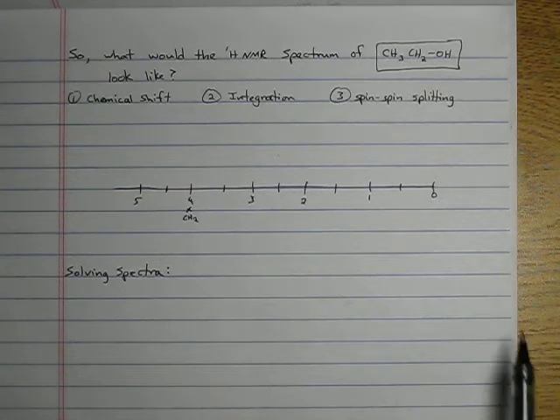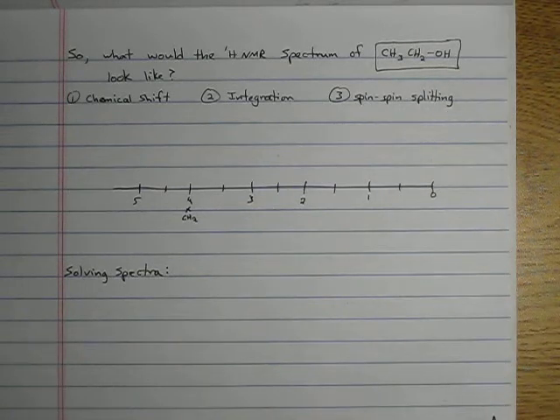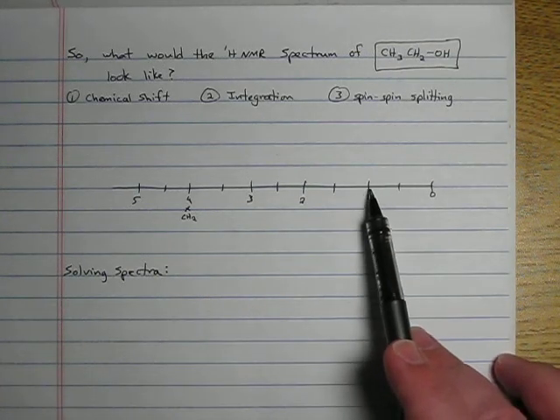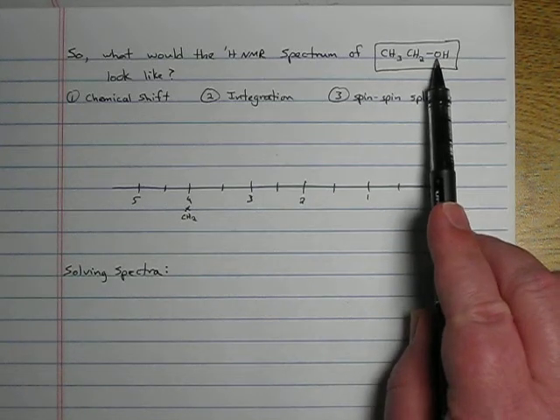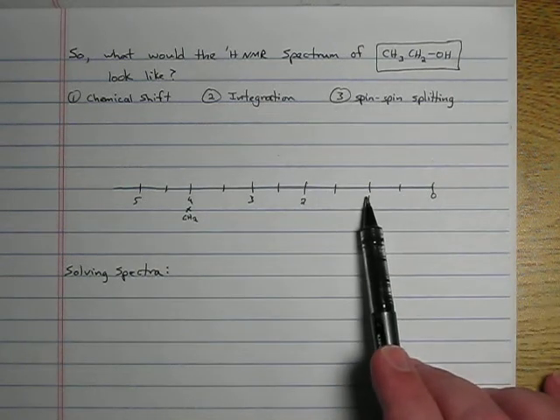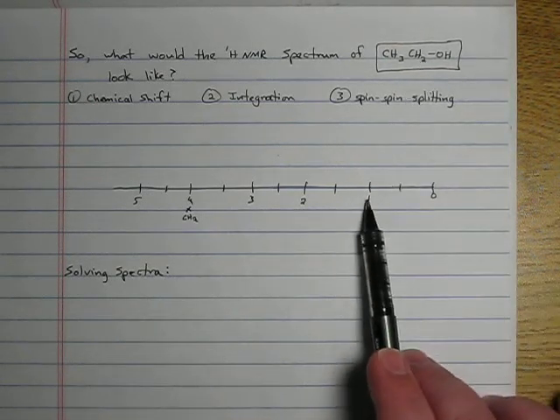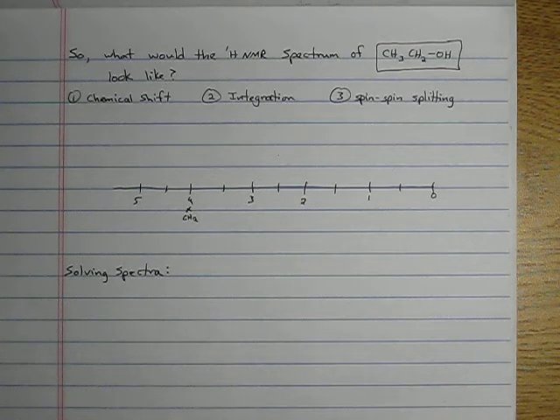All right, what about this methyl group? Well, that's kind of saturated alkane range, right? It's just a CH3 bonded to just a CH2, nothing special there. So that comes down around 1 ppm. Note, this oxygen pulls these hydrogens downfield. If everything was a saturated alkane, it would come around 1 ppm. These come around 4 ppm because that oxygen has pulled them downfield by about 3 ppm.